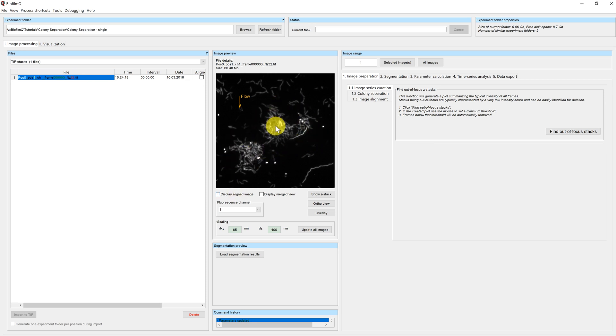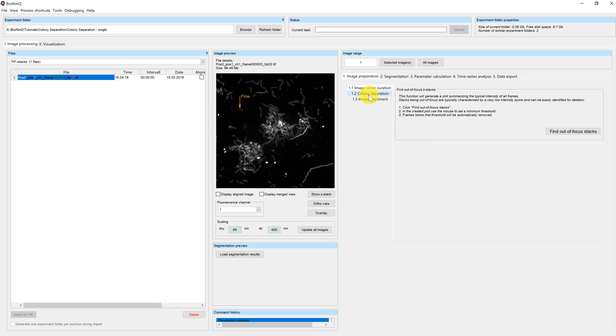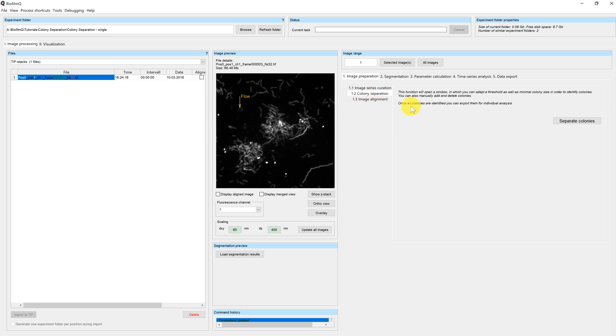We want to separate these two biofilms with the colony separation tool in Biofilm-Q. You can find it in the image preparation tab on the right hand side of the image processing window. To start it, just press the button Separate colonies.